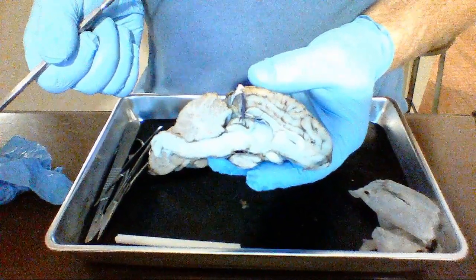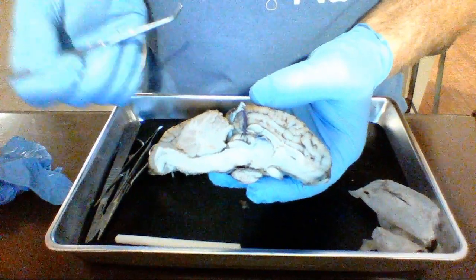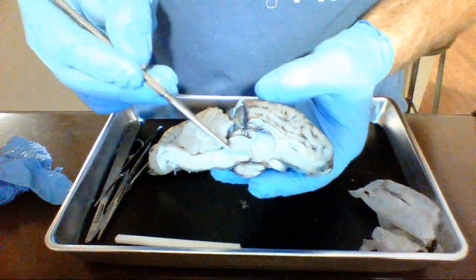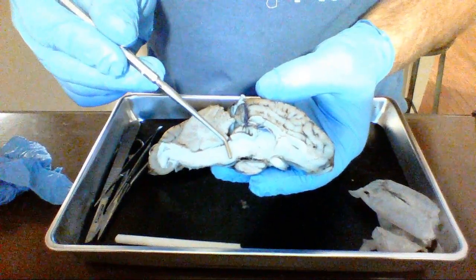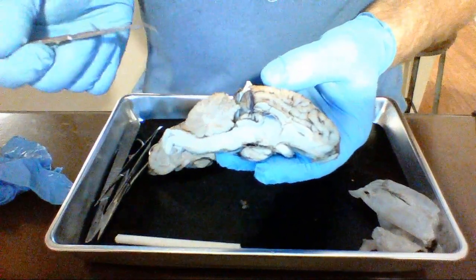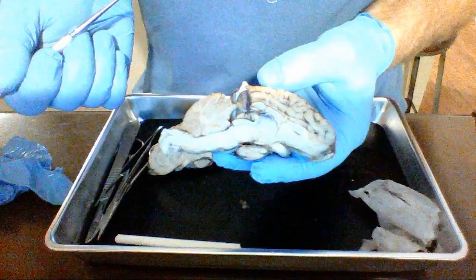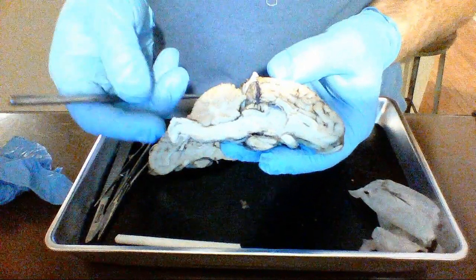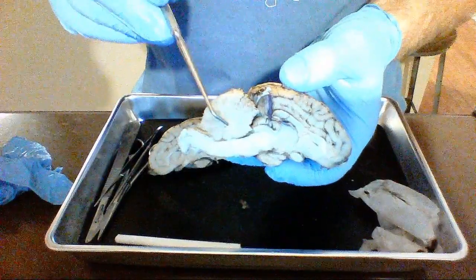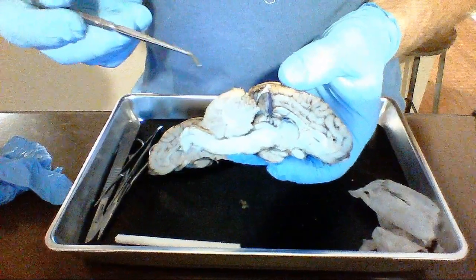Now let's look at the parts of your brainstem. So your brainstem is that lower level unconscious functioning. So the closest to the thalamus is the midbrain. Then you've got your pons, which sticks out inferiorly. Pons means bridge. And then below that, you've got your medulla oblongata. And then you've got the cerebellum, with this beautiful branching called arbor vitae. Arbor means tree, and this does look like a tree.